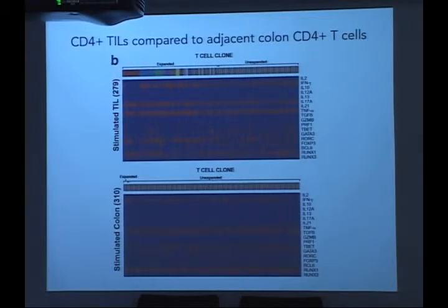And you can see not only the amount of clonal expansion, of course, but you can also look at a phenotypic profile on each particular T cell clone. So here we show how we can link TCR specificity to phenotype.